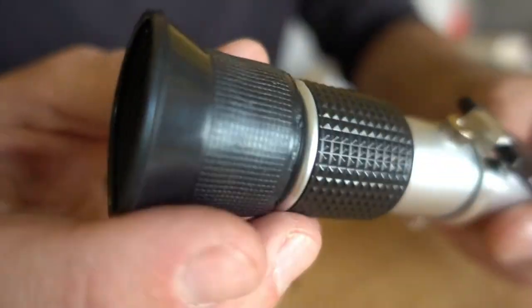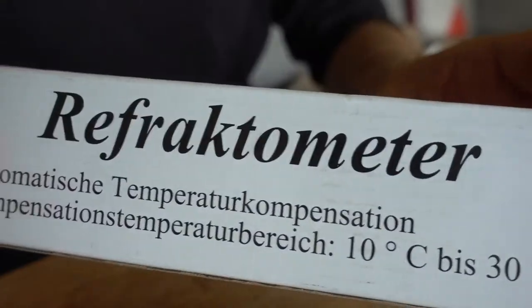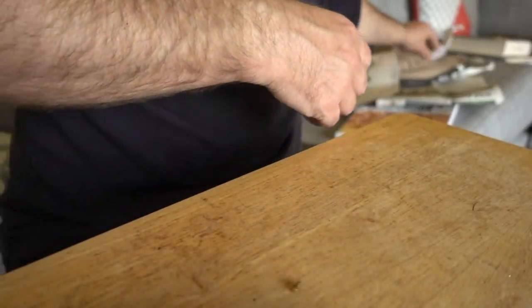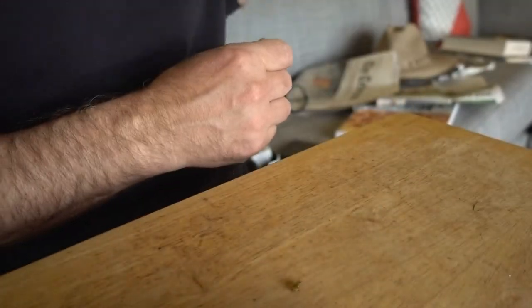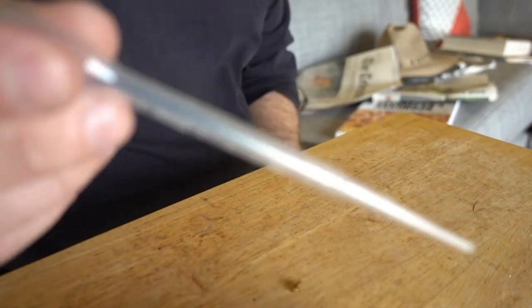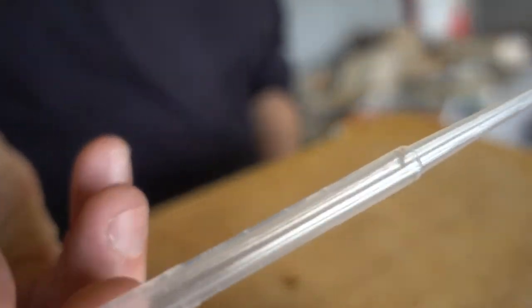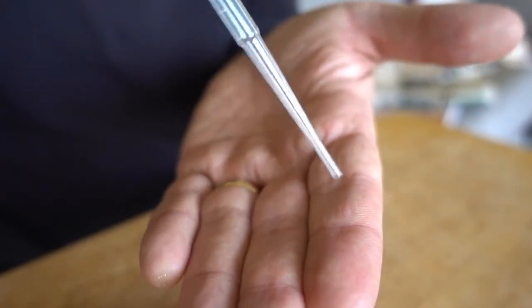But anyhow this is the cheap knockoff version. These things don't come with the greatest instructions. They've got all kinds of languages written on them and I've got a bunch of instructions here that are just crammed into the box and they don't tell me anything. They've got one of these little things for sucking up your honey or whatever.